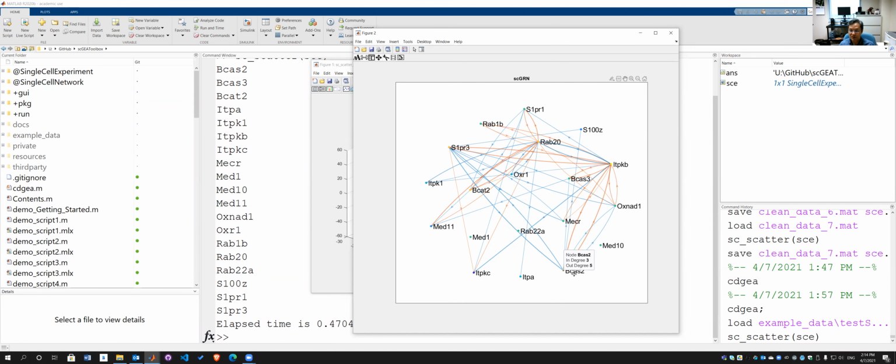But if you select the right gene regulatory module, you may know exactly why from other evidence or previous knowledge, for example, this gene should be negatively correlated with this one because they are supposed to be anti-correlated in their regulatory relationship in these cells.